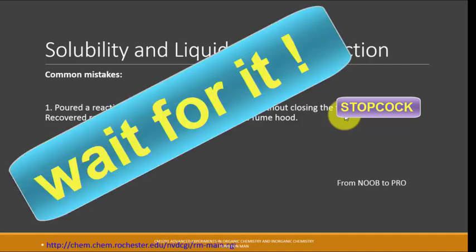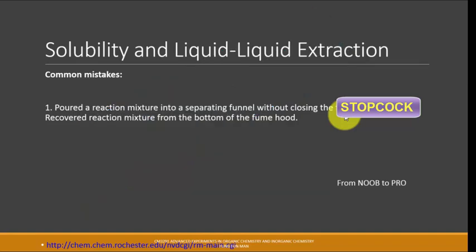They can only use paper towel and then try to squeeze it in. It's very nasty. So please always check. Make sure all the stopcocks are sealed, tight, and nothing's leaking first. Test it out before you conduct this liquid extraction. Okay.